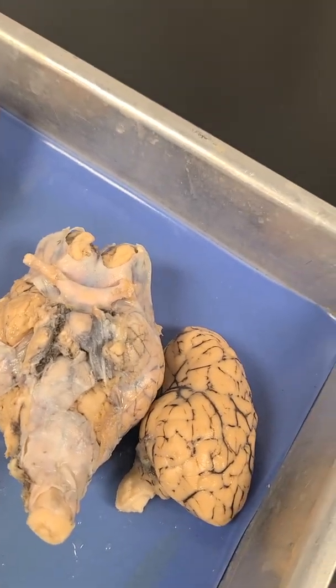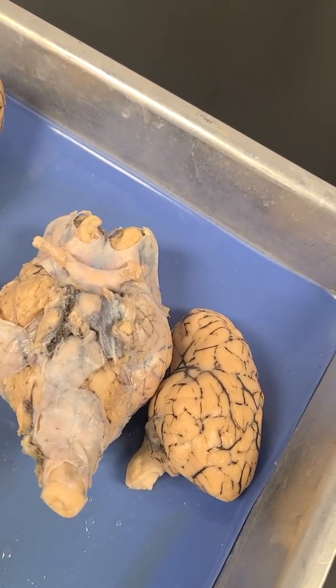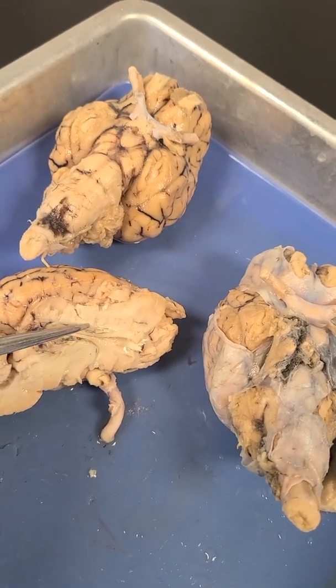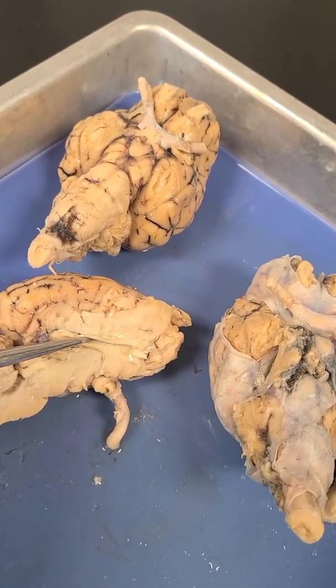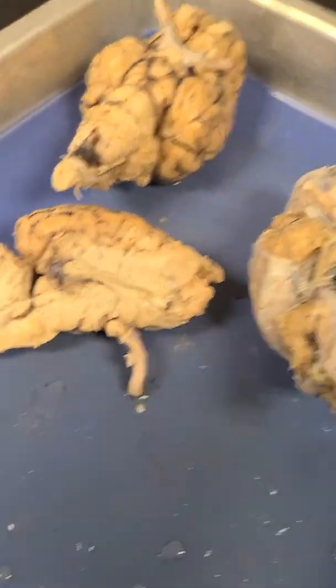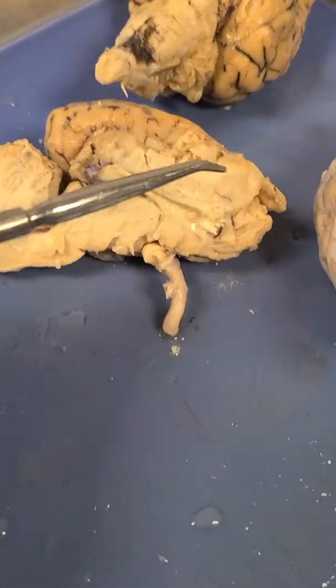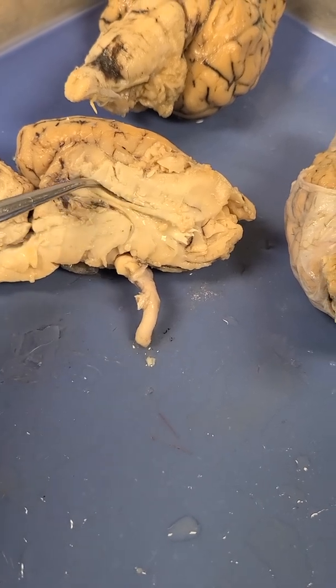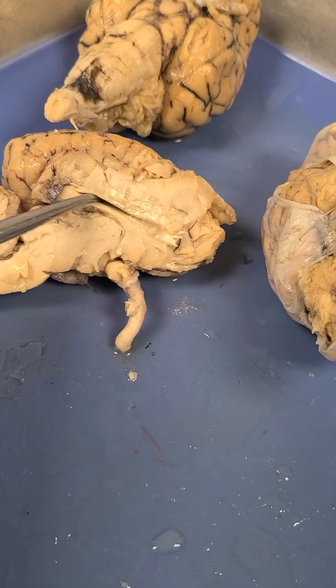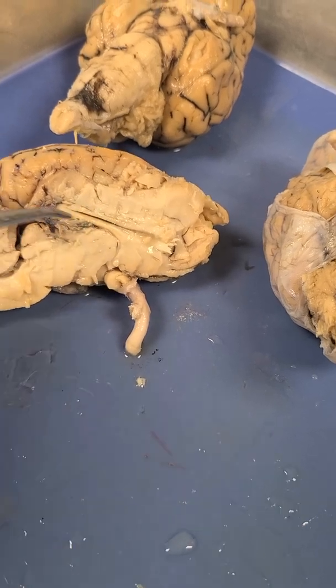So surrounding the lateral ventricle is a corpus callosum, and that is the white matter that connects the left and right hemisphere with each other. So you can see this little kind of U shape right here. Okay. So this, in the middle of it, is the lateral ventricle.